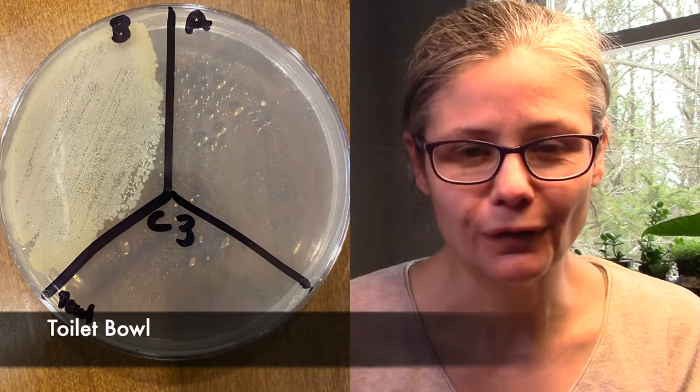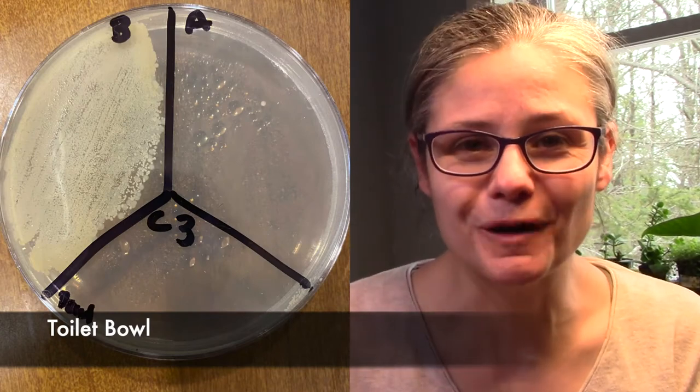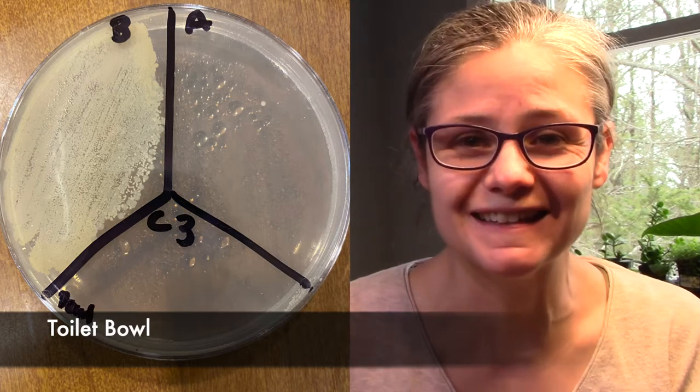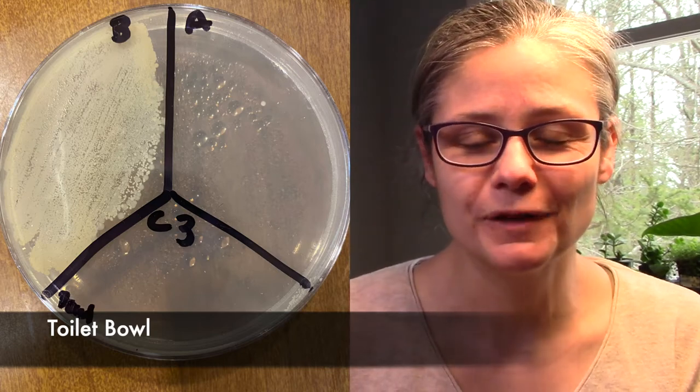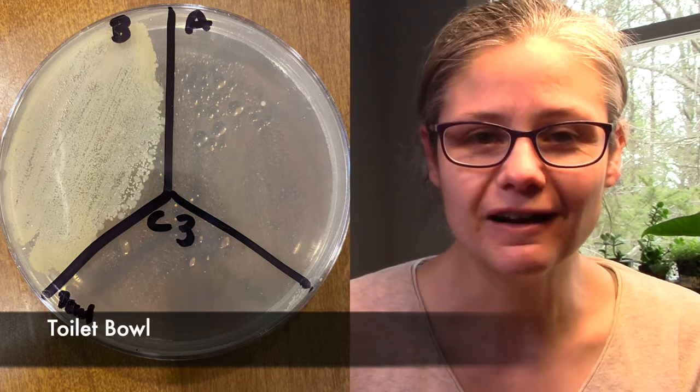The toilet bowl. Look at that — the before section has so much bacterial growth, it's crazy. And then the after section, it's really hard to see — there are a very few tiny, small bacterial colonies. The Microband does a fantastic job at disinfecting the toilet bowl.